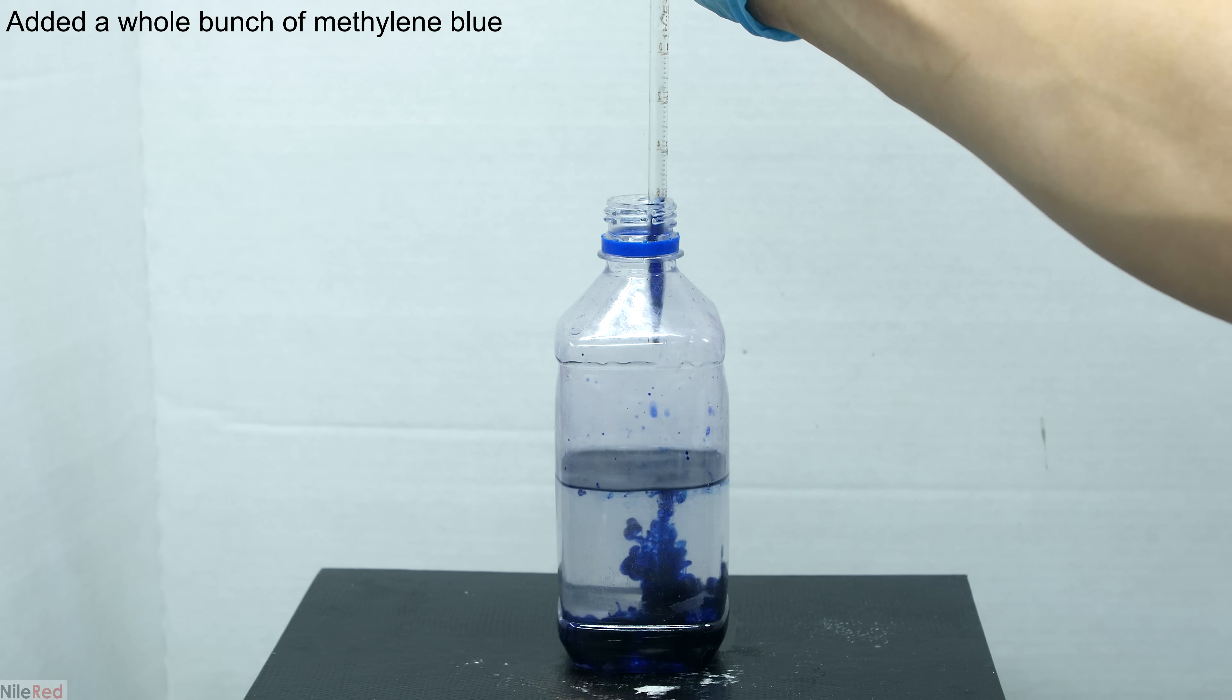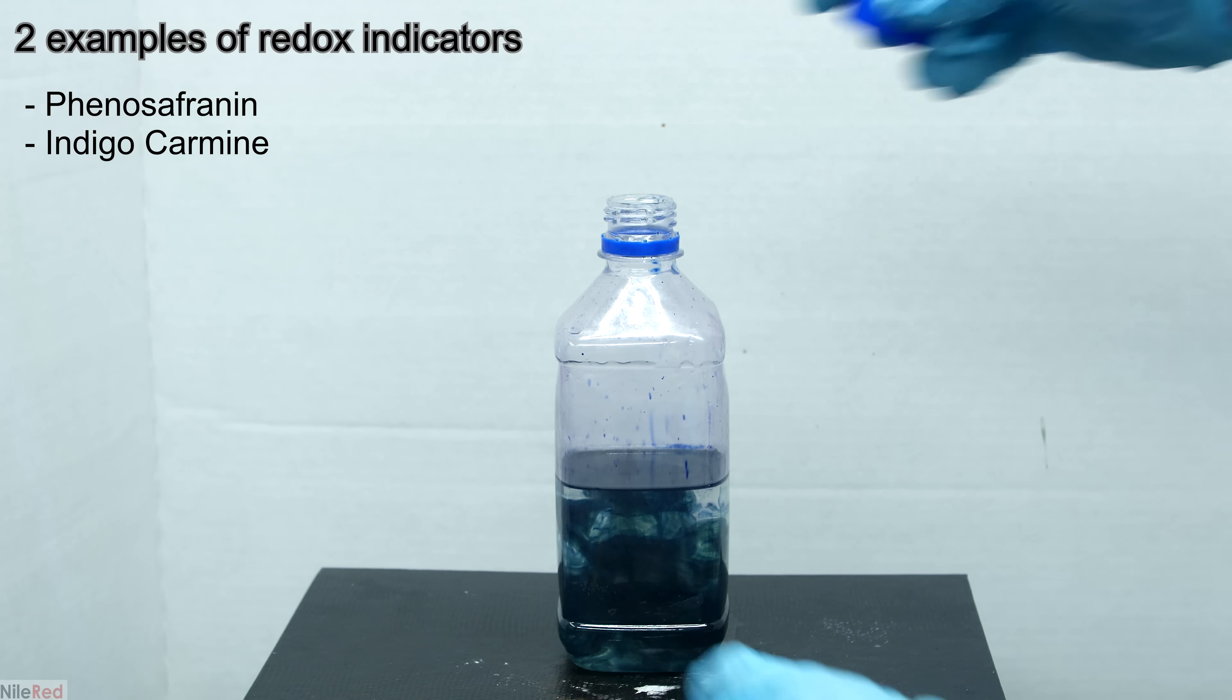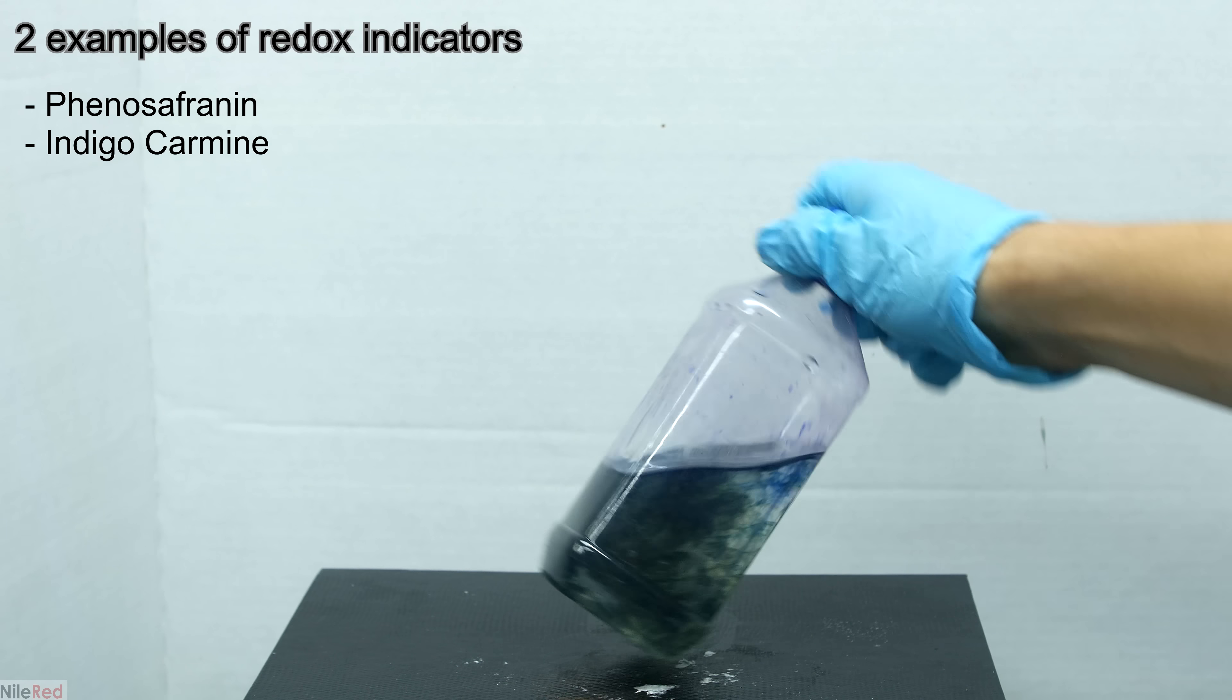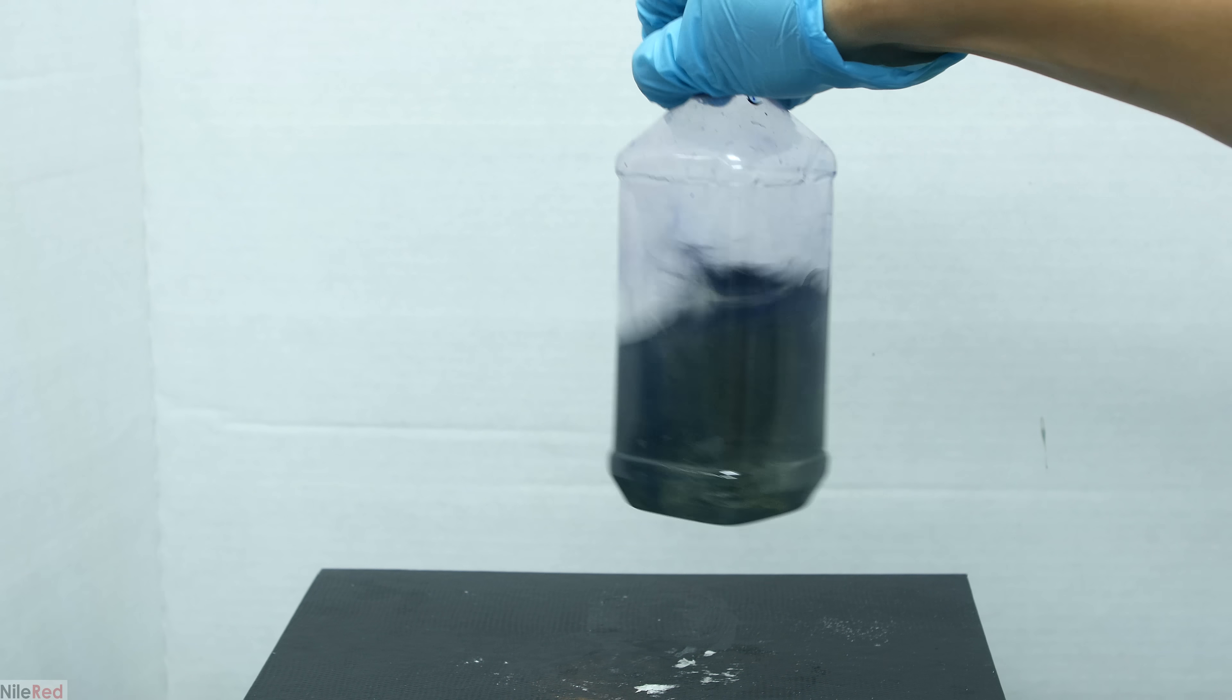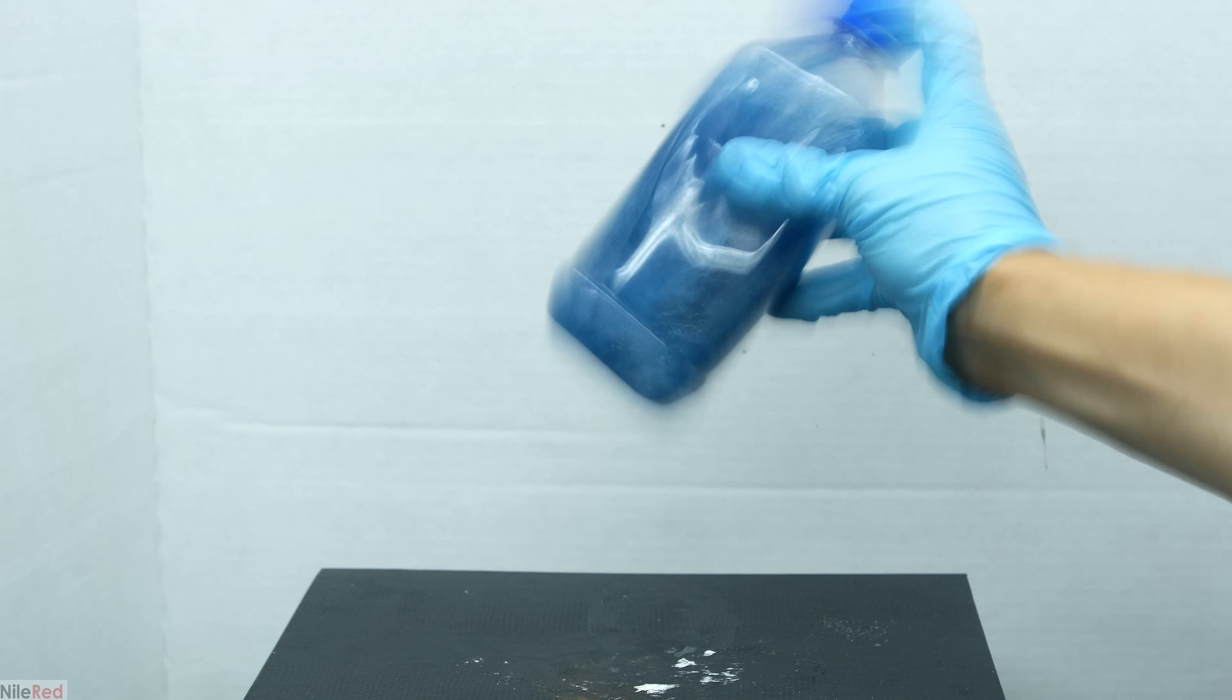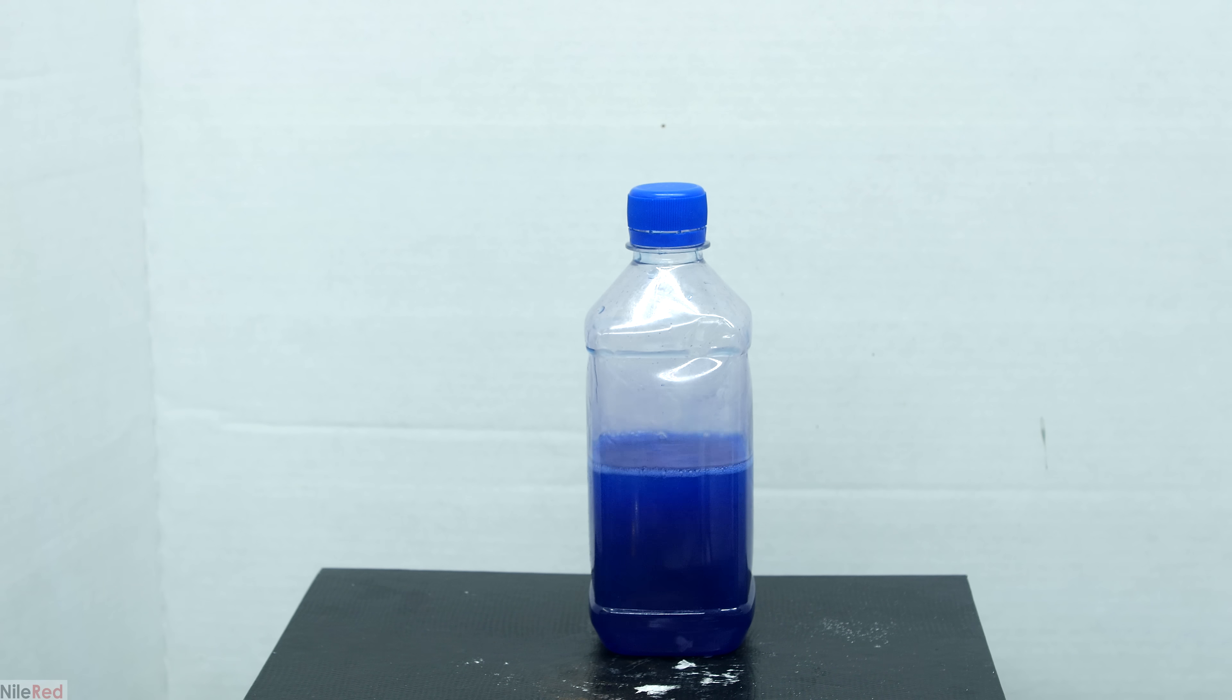Methylene blue isn't the only indicator that can be used in this type of demonstration and we can also use other redox indicators. All we really need is another indicator that changes its appearance depending on its oxidation state. On top of this we don't need to use glucose and potassium hydroxide as our reducing solution, we can also use something else that's capable of carrying out a reduction reaction.